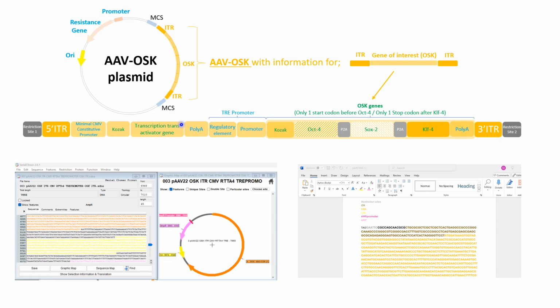Well, once we understand the different parts of the plasmid, the only thing that you have to do is copy and paste one sequence after another. You can use, for example, specific text editors for DNA, for example, SerialCloner or SnapGene or another software, or you can use simply Word. I have to say, if you are going to go for Microsoft Word, try to use a lot of colors, identifying every single part. Otherwise, it gets messy because it's a lot of information, it's a lot of text.